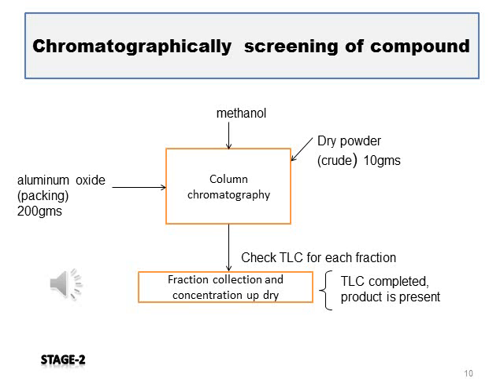Segregation was done as per the TLC result. The fractions that completed TLC were sent to get dry powder through evaporator techniques, up to the collection of the fractions in stage 2.